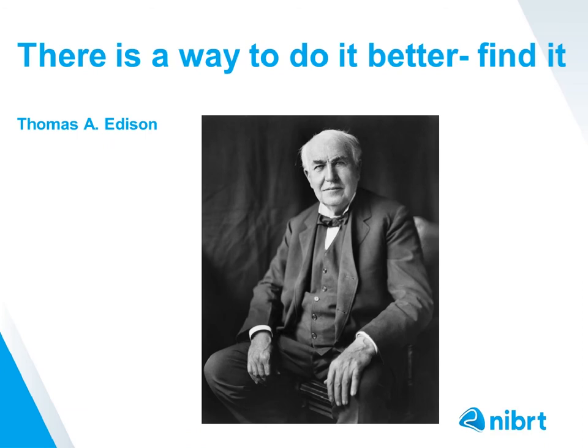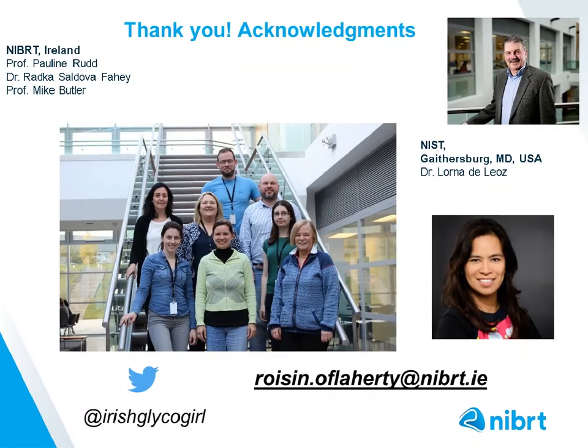And personally, I think one of the ways that we can do this is to merge technologies together, so to potentially use some of the strengths of some technologies and merge them with some of the other technologies, and this will give us the highest level of depth of information and the highest number of compositions, so to get really low abundances of certain glycan epitopes, which, as we know, might link back to safety and efficacy.